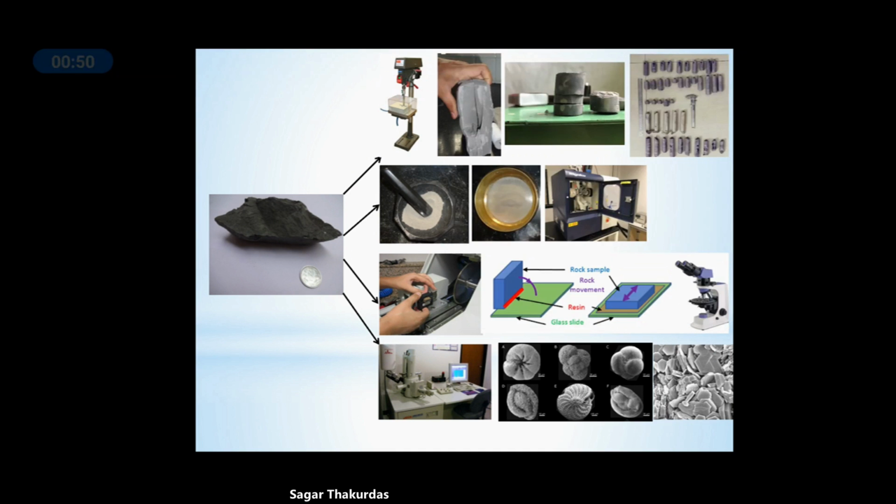Now first, from this irregular rock sample, which is shale in this case, if you see on the top, core plugs were extracted. Cylindrical core plugs were extracted from the host rock. You can see the host rock in the next picture, and you can also see the core plug, and its scale can be identified with the help of the matchbox which is in the background. So it is around 1 inch in diameter and 1.5 inch in length, and you can see the parting planes, the fractures within this core plug.